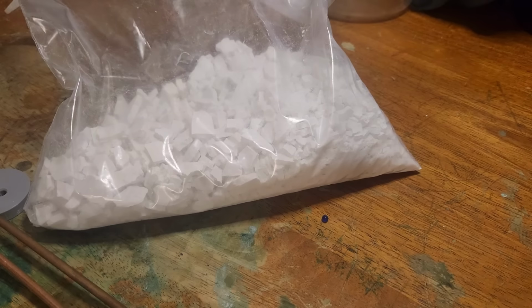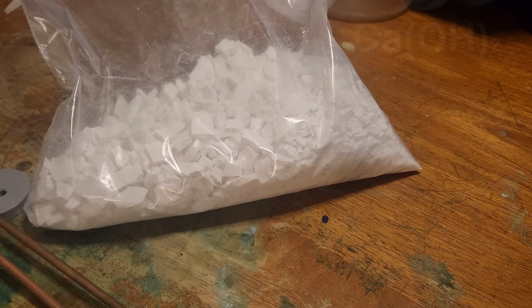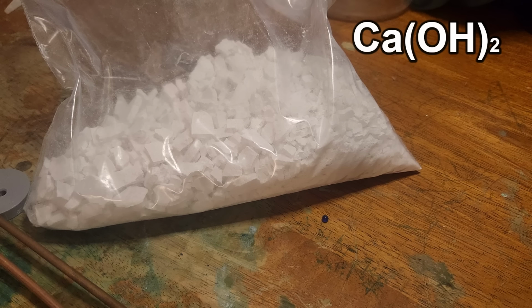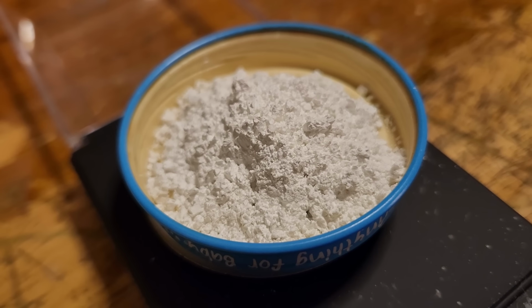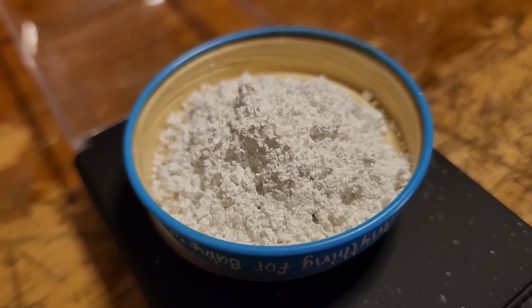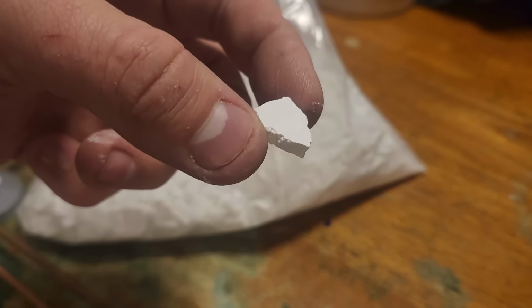To do that, I made some calcium hydroxide, or slaked lime. You can buy this stuff pretty cheap, but I actually made mine for another project. It's pretty easy to make by just reacting calcium chloride with sodium hydroxide, aka road salt and lye. Now, having this in a fine powder wouldn't really allow gas to flow through it, so I've dried mine into these little chunks.